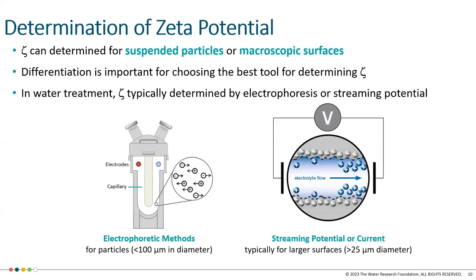The last point I wanted to make, having done a lot of zeta potential analysis, is it's important to note that when you have low concentrations of particles, what can happen is these analyses can become really challenging in some cases. And this gets at the idea that I previously made about the analyzers taking time to converge on an average value that is within a specific tolerance.